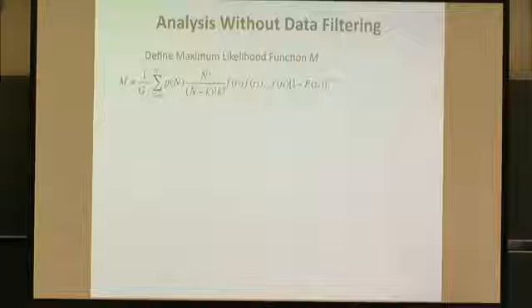And then you have a binomial prefactor here that you need to basically weight the unfolding probabilities of each individual domain. So f of t1 up to f of tk is the probability to have unfolded by time t. And then you need to multiply that by the probability that there is a certain fraction of molecules that didn't unfold in the time of your experiment. So these are the unobserved events, if you like, which are weighted by, there's n minus k of those events.